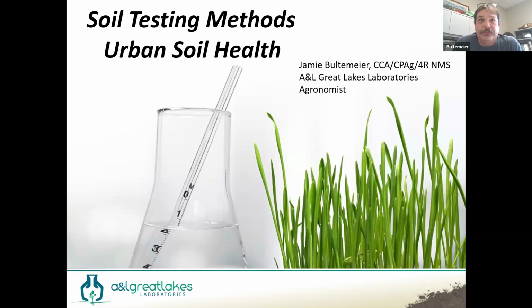What I want to do today is set us up for a good question and answer session at the end of the presentation. But to do that, I want to walk through soil testing methodology. There's oftentimes confusion, lack of understanding, misunderstanding, misconceptions about what the data means and what we do with it. And so to start off, I want to give a very brief tour.